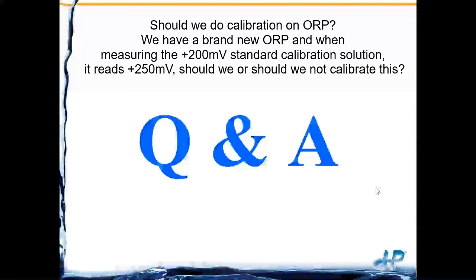Question: should we calibrate ORP? We have a brand new ORP probe — measuring a 200 millivolt standard calibration solution it reads 250. Should we calibrate? Since that's 50 millivolts outside the plus or minus 30 millivolt range, yes, it's good practice to calibrate. Also important: if you use a combination electrode measuring pH and ORP simultaneously, doing a pH calibration will affect the zero offset for your ORP value — check with your electronics supplier about this.